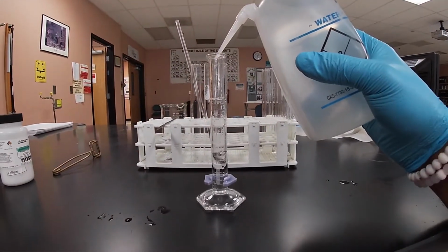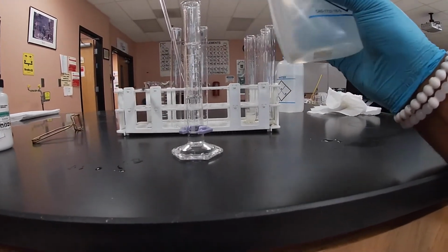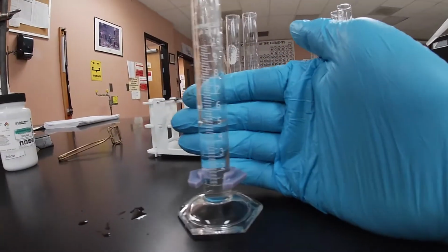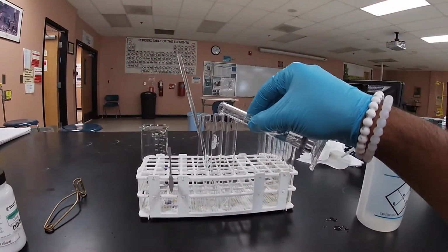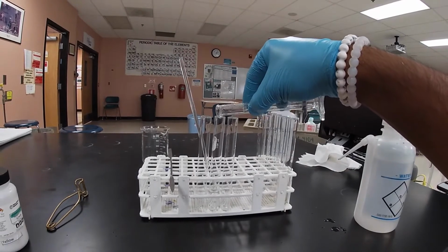I think we should be good there. Get your measurement. We're gonna add about 5 mils. Go ahead and add it to our second test tube.